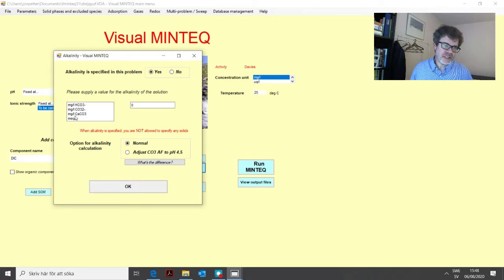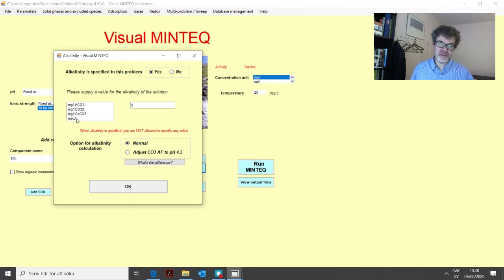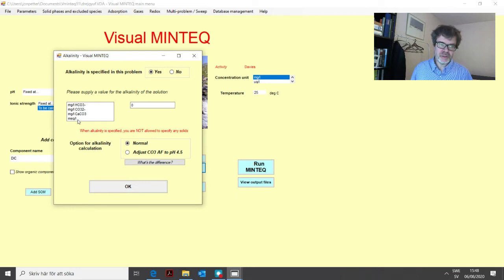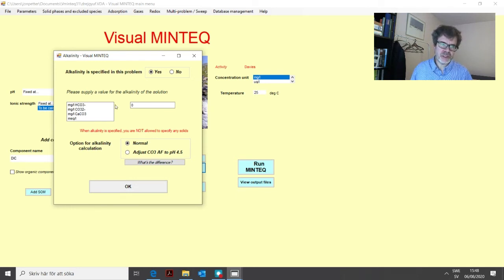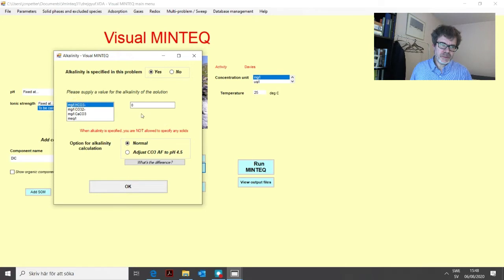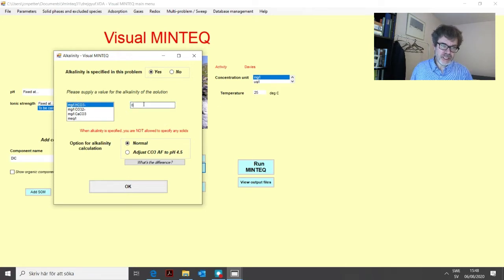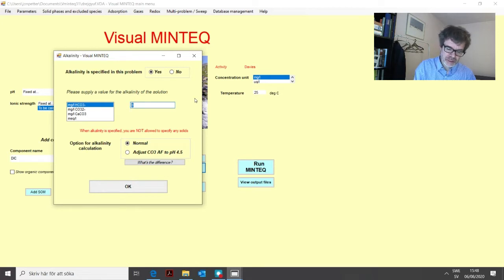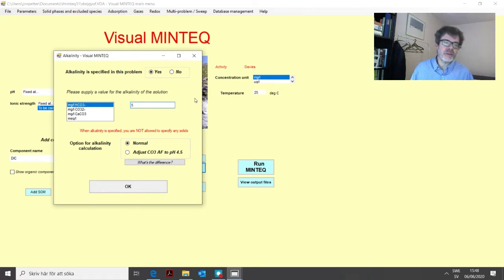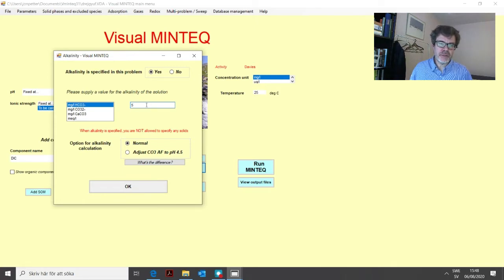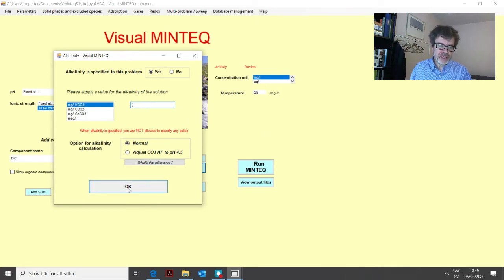There are four different options for alkalinity. It depends on what unit was given in your analytical report, so to speak. Now we can take this example. If we have measured five milligrams of bicarbonate, so we enter the value of five there.